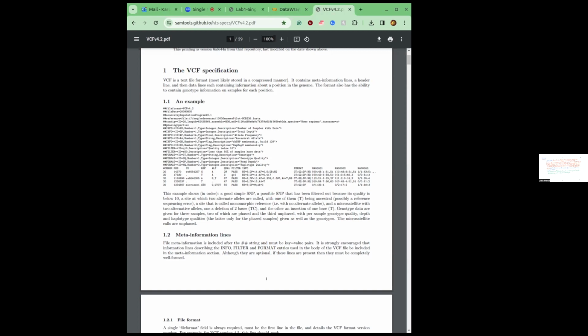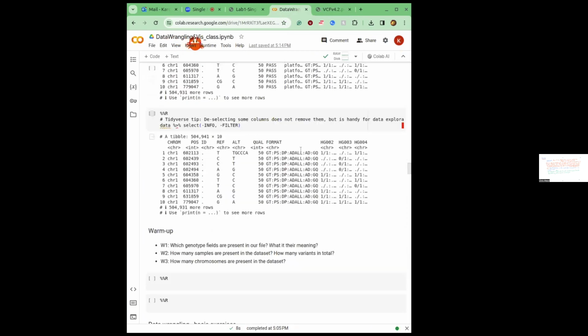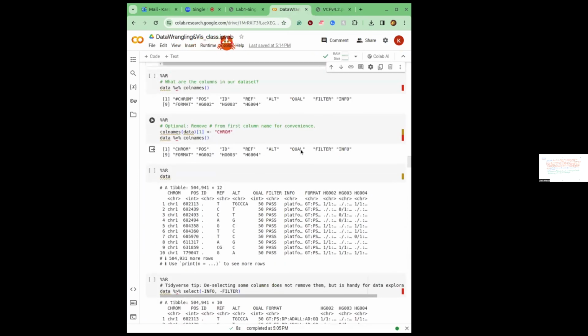Okay, I mean, there's 3. Sorry, I think there was something wrong with my code. I selected from the 8th column to the end column, because I thought maybe there were hidden columns. Yeah, so there are three columns here.